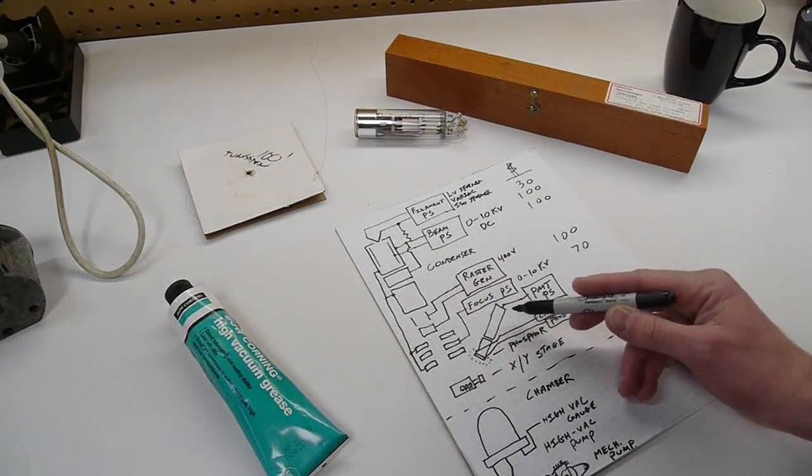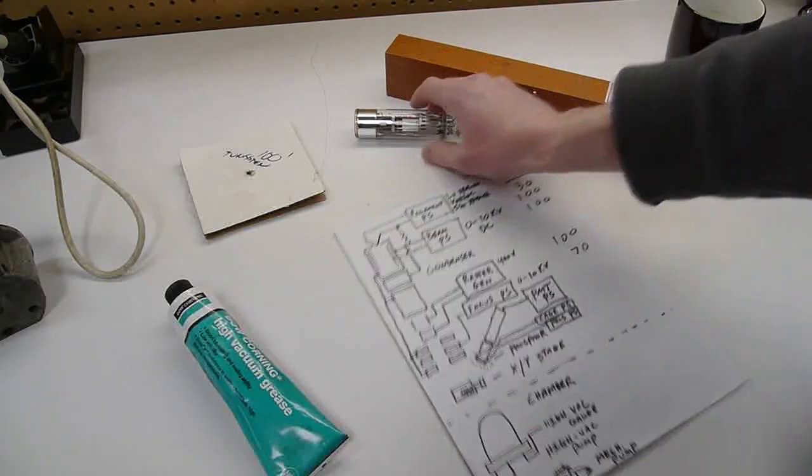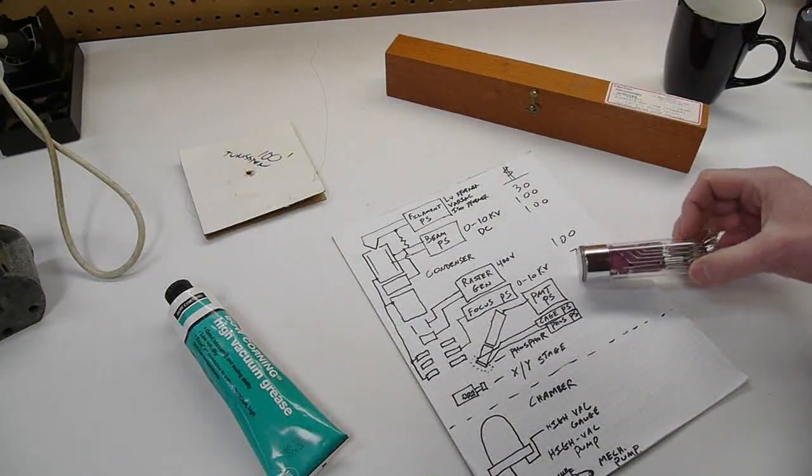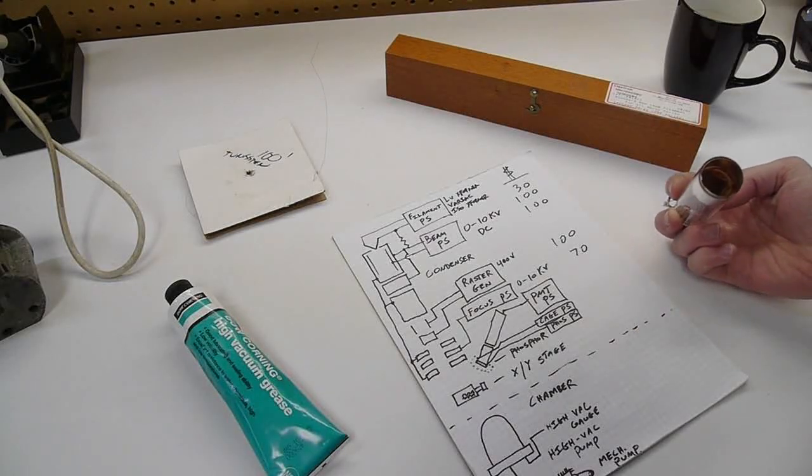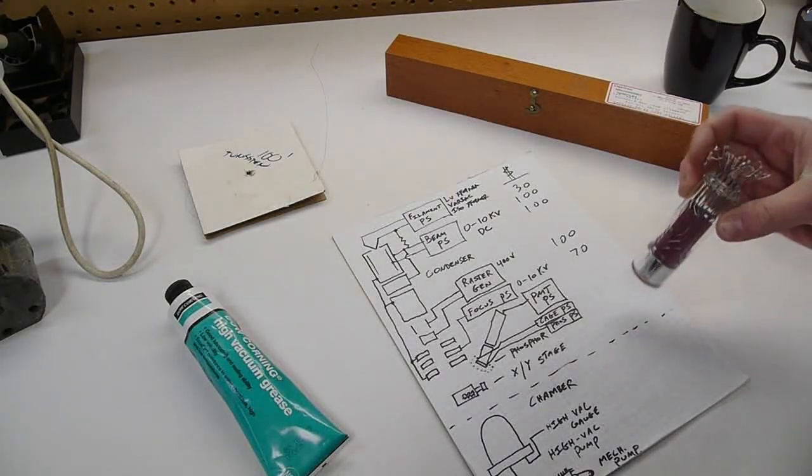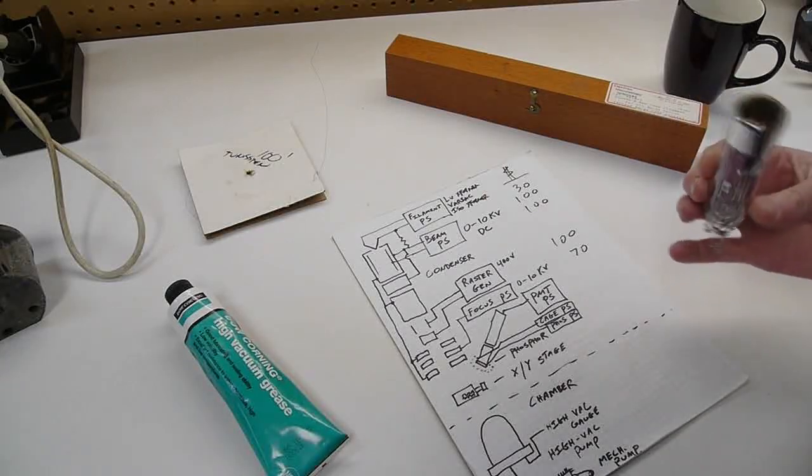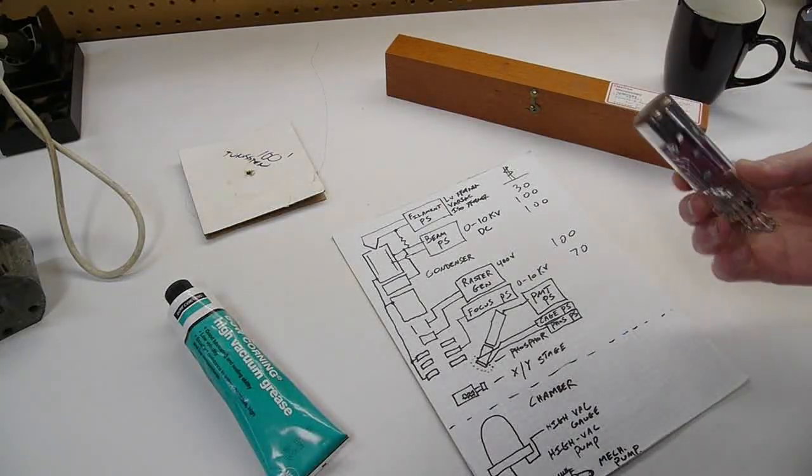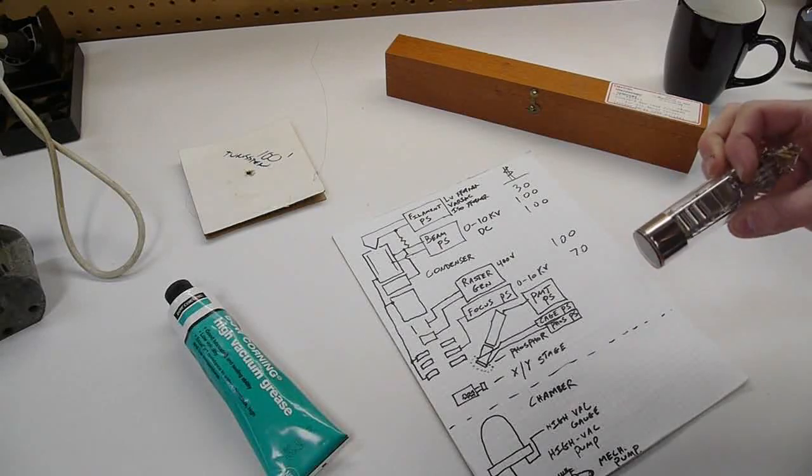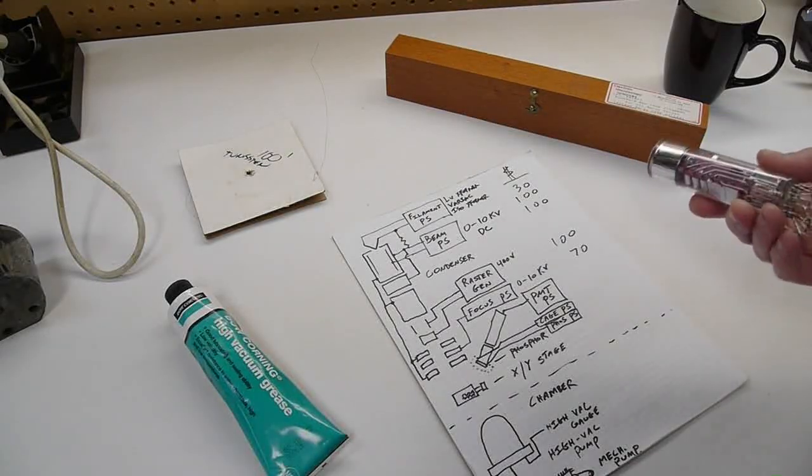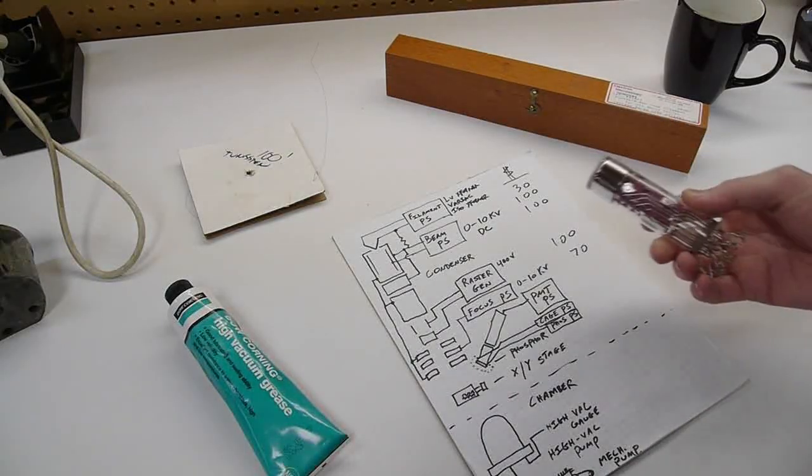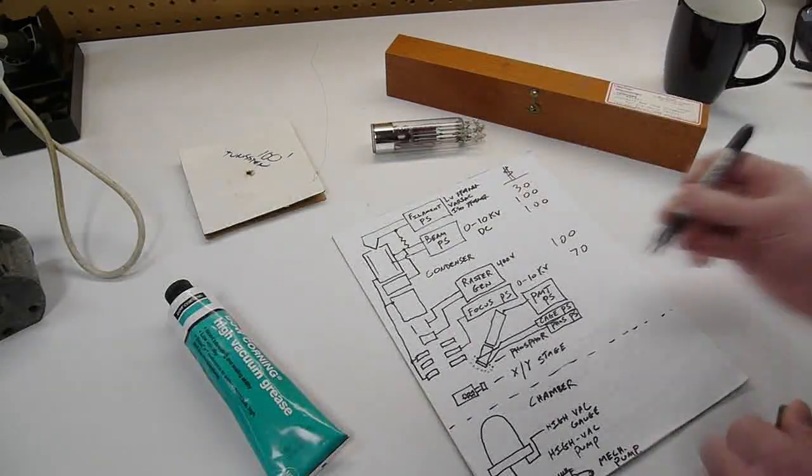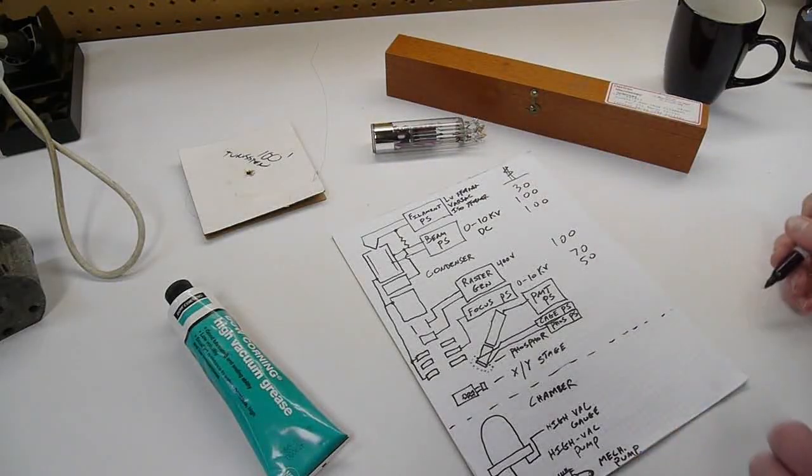Then we have the photomultiplier itself. This is the one that I used. It is a Hamamatsu R6094. I don't think there's any more of these on eBay, but there might be. I only paid about $35 for this, which is a little bit lower than the average, but not much. You can go on eBay and find photomultiplier tubes for $50. So we'll put down $50 for that.